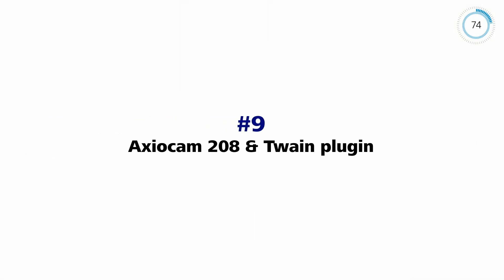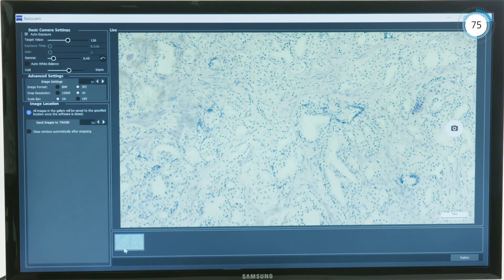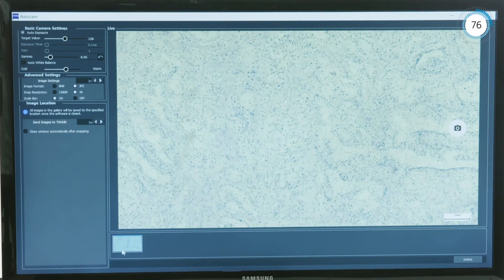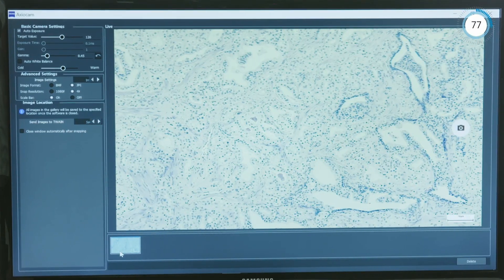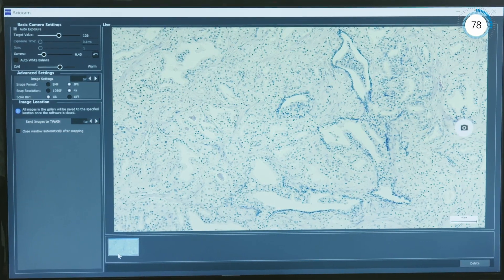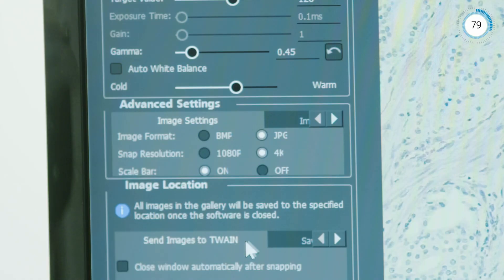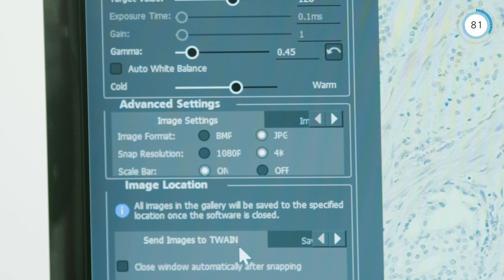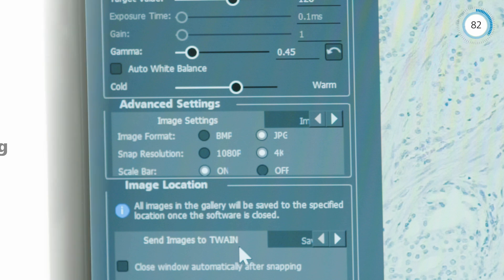With Axiocam 208 Color and the Twain plugin, you can acquire microscope images with Twain-compatible apps and laboratory information systems.